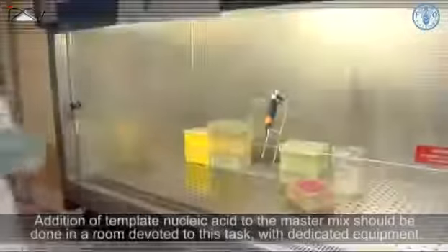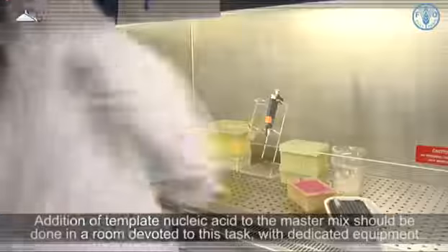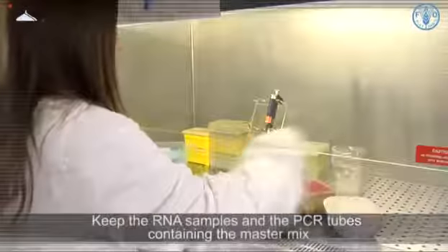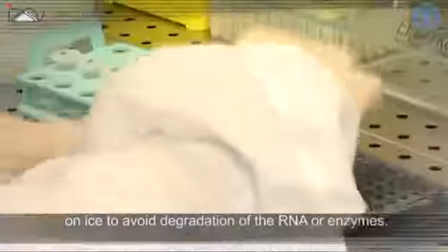Addition of template nucleic acid to the master mix should be done in a room devoted to this task with dedicated equipment. Keep the RNA samples and the PCR tubes containing the master mix on ice to avoid degradation of the RNA or enzymes.